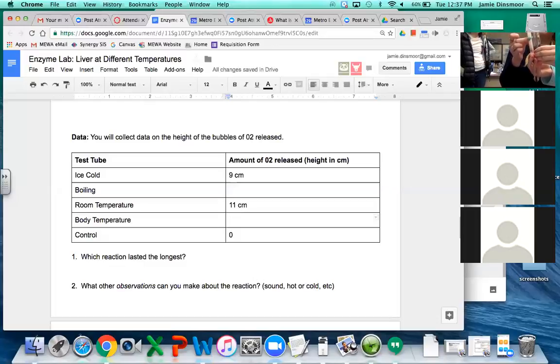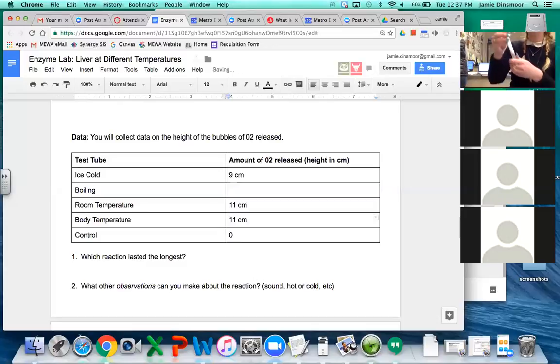So what would you say that would be? Let it keep going. It's kind of 11. For the body temperature, we got 11.